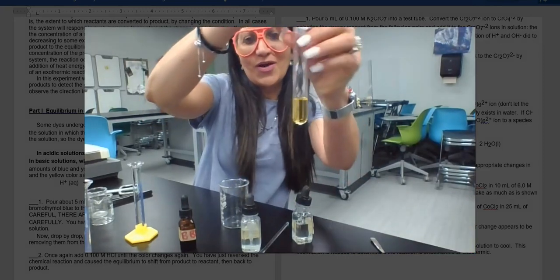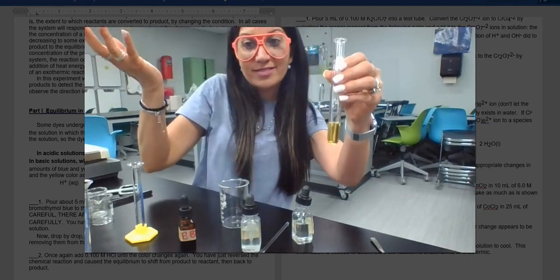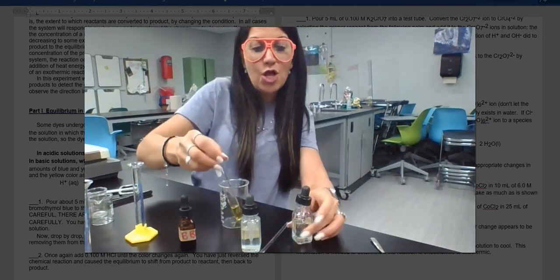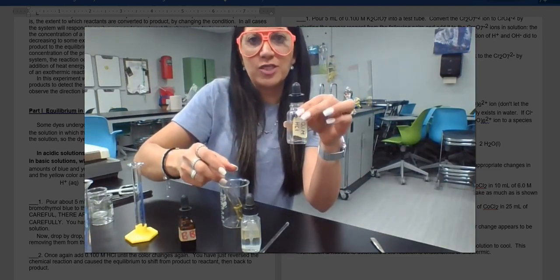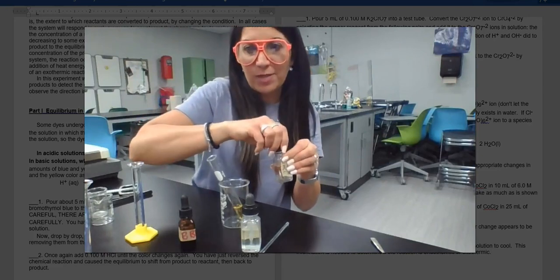Okay. So it says record. You have now increased the concentration of H+, because we added acid to it, and HCl will actually break up and form H+ and Cl-. So I know that I just added H+ to it.